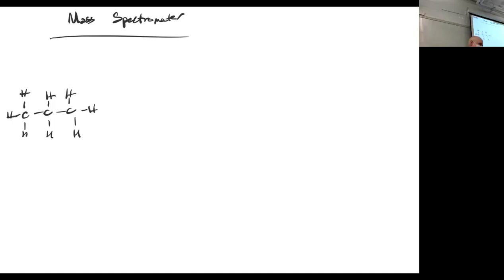So we're going to start in about 10 minutes looking at spectra and interpreting them. That's where you need to write stuff down. That's what I'll be asking you about. So we'll start going forward. That is to say, here's the molecule, here's what the mass spec looks like. But your quizzes, which is the overall goal of spectroscopy, is to have a spectra and be able to say, what does this mean? So basically kind of doing it backwards. We'll be doing that in class today. We'll be doing it in lab starting today. We'll be running IRs starting today.